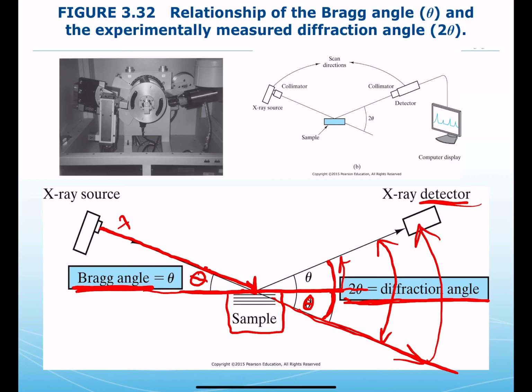And that represents the x-axis coordinates for our information. Okay, so shown a little bit better here is that as we try to sweep and acquire data, we're expecting the x-axis of our graph to be 2 theta as we consider moving the detector through a range of 2 theta values for the sample.